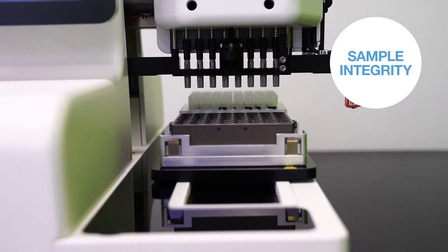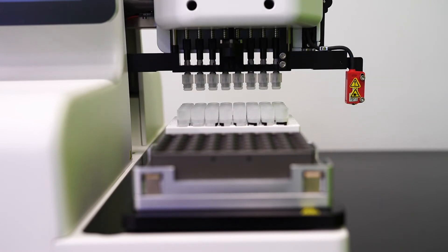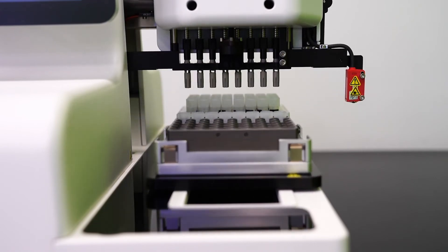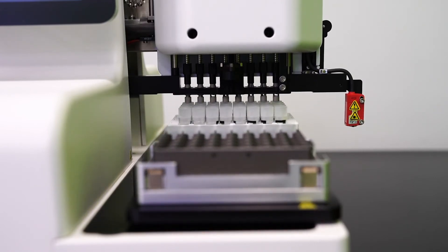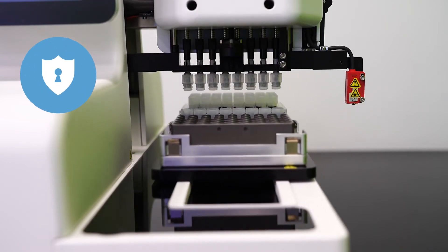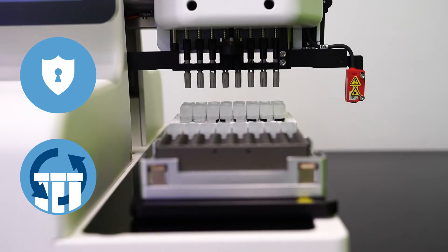Now let's talk about sample integrity. The Decapper caps and decaps in a sequence from back to front and then front to back, such that a cap will never be moved over an open tube, virtually eliminating potential cross-contamination. There are also some other built-in features, such as secure mode and row loop, which offer additional sample integrity precautions.